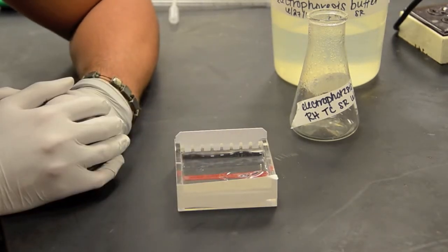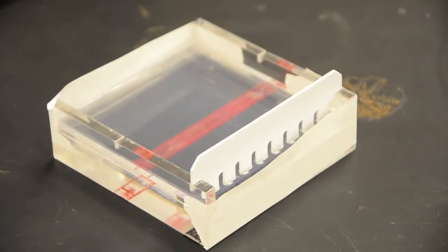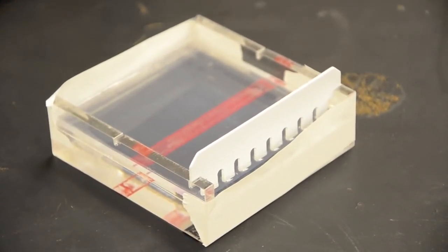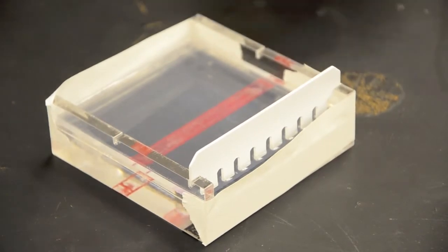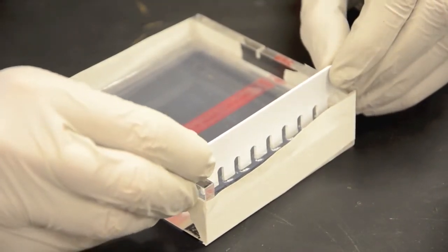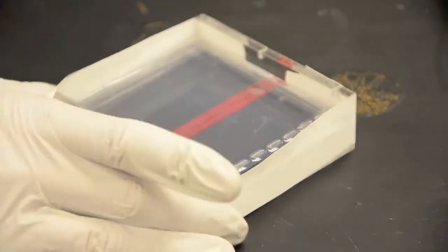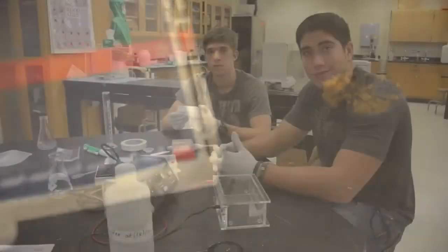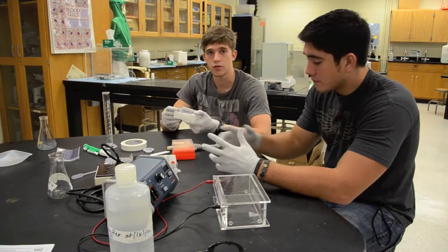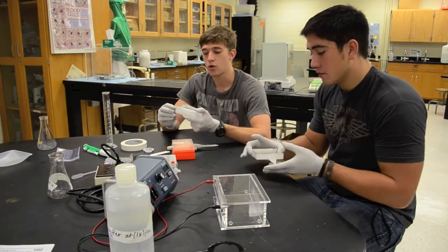Okay so after the gel has solidified in the gel bed the next step will be to remove the comb which will create your wells. Now you're going to do this very carefully with two hands, make sure you do it very evenly and here we have our wells.